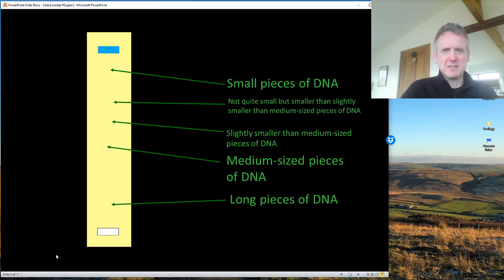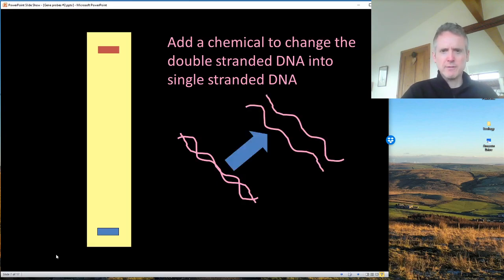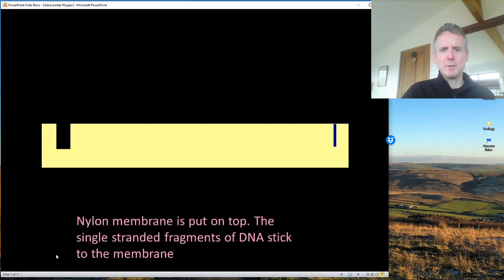I need to get a probe to it. I need to get it out of the jelly, which is now the next step. I want to add a chemical that turns DNA from double-stranded into single-stranded. I could heat it to 95 degrees C, like in PCR, to break the hydrogen bonds. However, that would melt the gel, and I'd lose my organisation. Enzymes are no use, so we use a chemical method, and we just use sodium hydroxide.